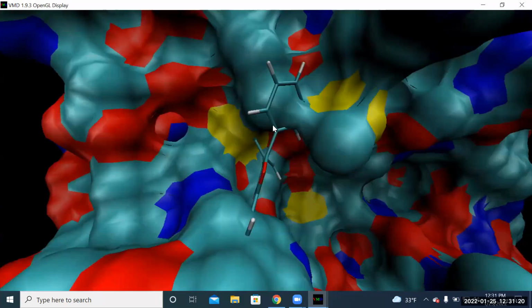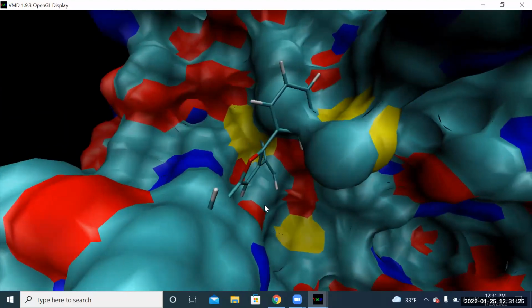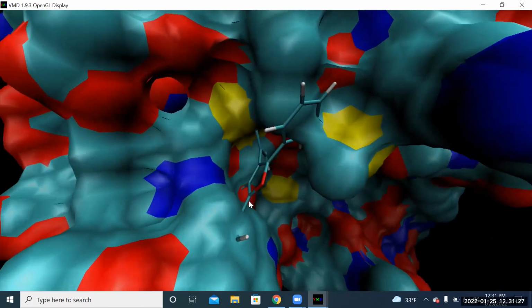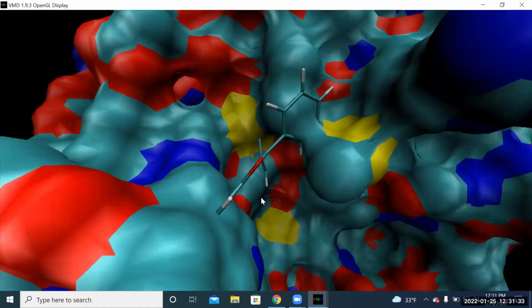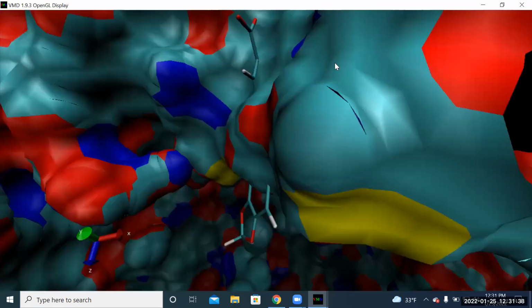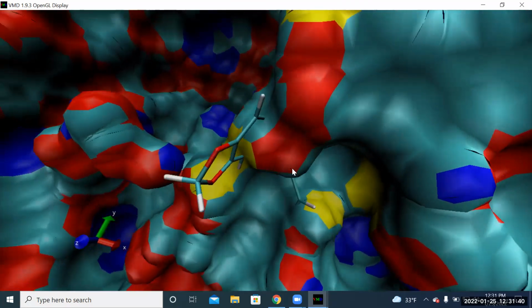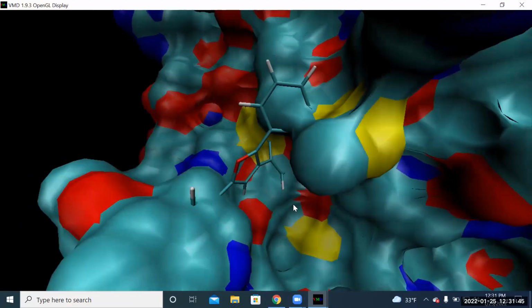I do get them to look pretty good though. And so if you look here, you'll be able to see where things look bad. Now, if it's this bad, you probably didn't do anything right to begin with. When everything looks good, all of these things that you're seeing poking through should be nicely nestled and resting on top here, and not sticking into the different areas. So that's the trick I use when I do this.